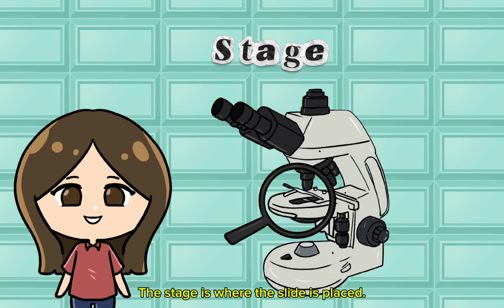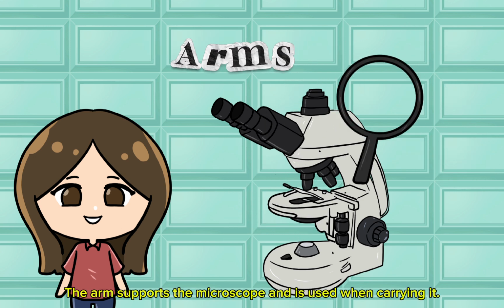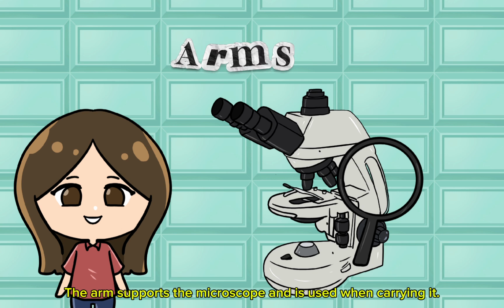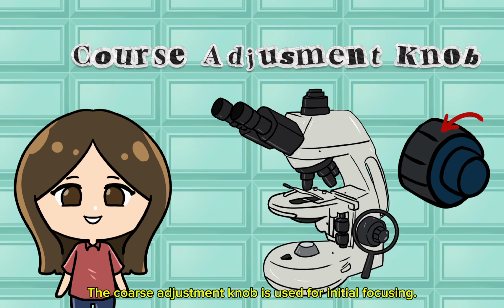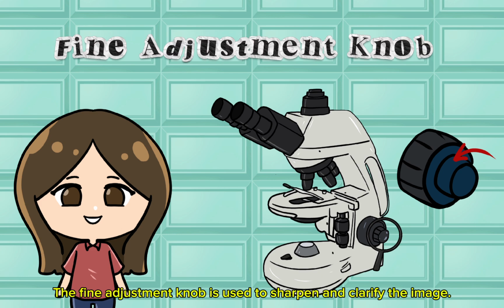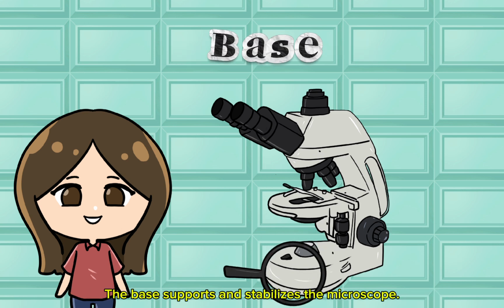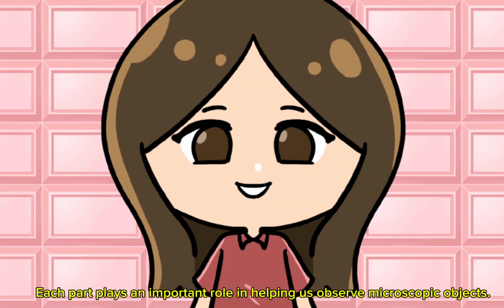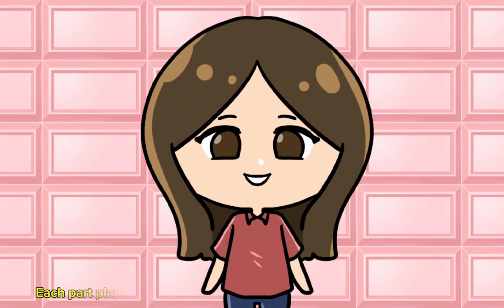The stage is where the slide is placed. The stage clips hold the slide in place. The arm supports the microscope and is used when carrying it. The coarse adjustment knob is used for initial focusing. The fine adjustment knob is used to sharpen and clarify the image. The light source provides light so the specimen can be seen clearly. The base supports and stabilizes the microscope. Each part plays an important role in helping us observe microscopic objects.